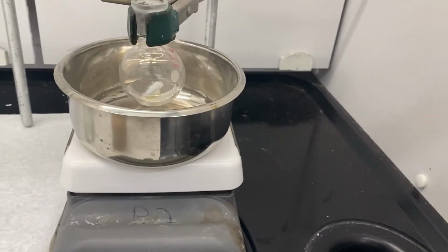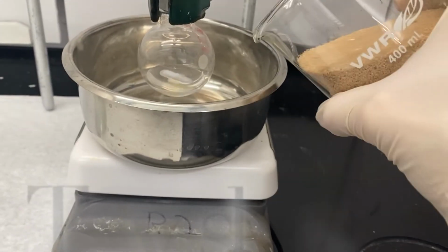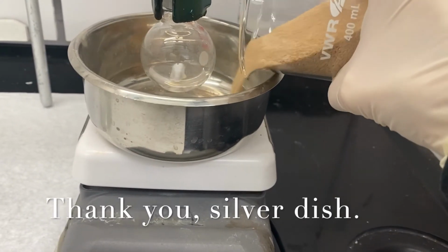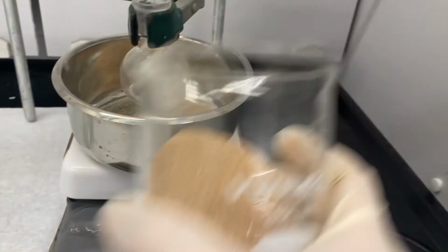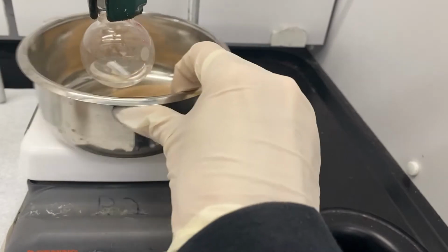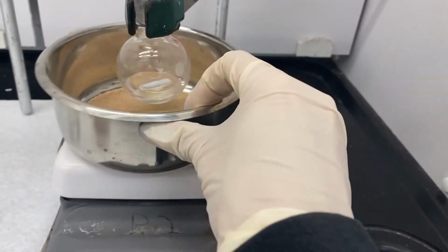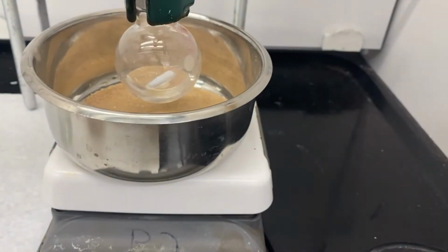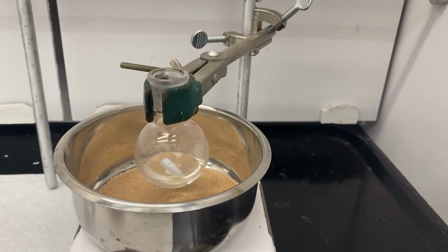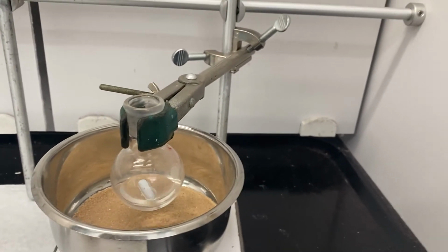And then my little silver dish here is going to allow me to add sand to it. And when I lower that round bottom into the sand, I'll be able to fill it even more. And remember, the sand is the only thing that's transferring heat to our round bottom, so we want to make sure that at least the solvent level is covered with our sand. We're also going to make sure that we don't lose any of our reagents, so we're going to add a reflux condenser.